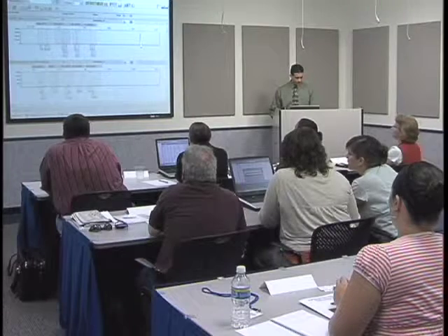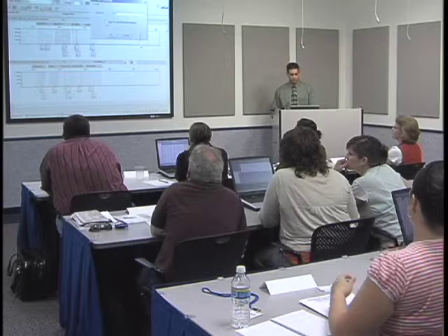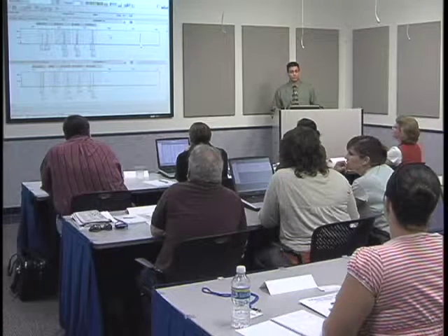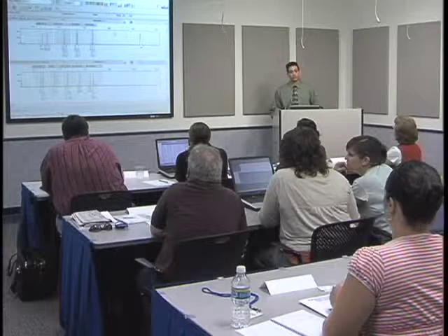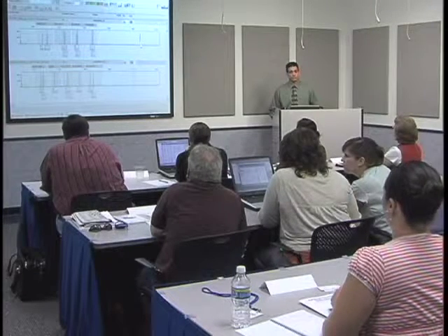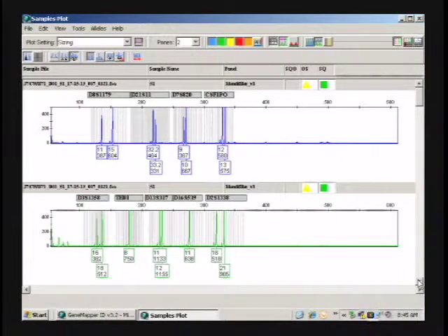Okay. And let's zoom back to about 5. What was the volume used for the remainder? It was the full volume. I used the full volume basically, and everything that was left I put in for the remainder ones. So this was number 51 we showed before. As you saw, the full volume ones, we got up to like 2,000, 3,000 RFUs. Here we're getting anywhere from 380 something, 600. We actually have something in the low thousands, 1,133 and 1,155.